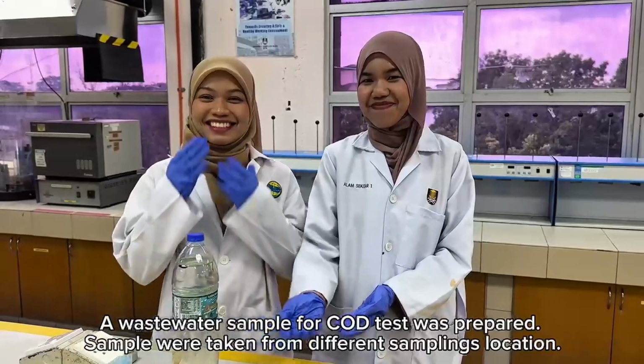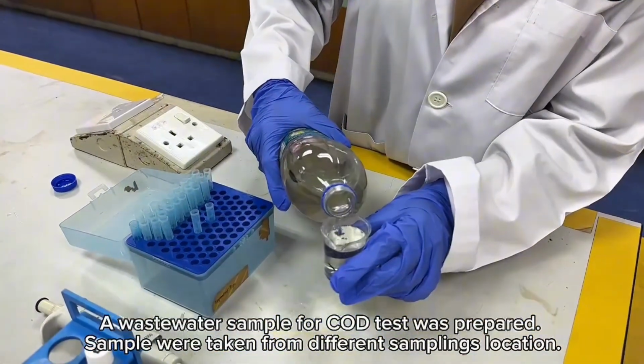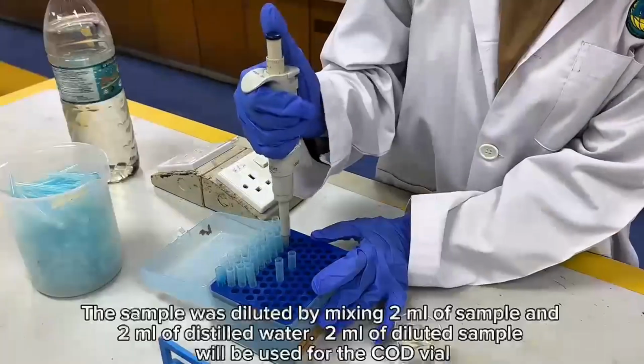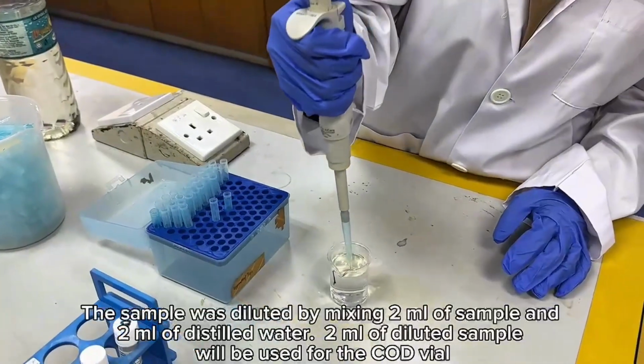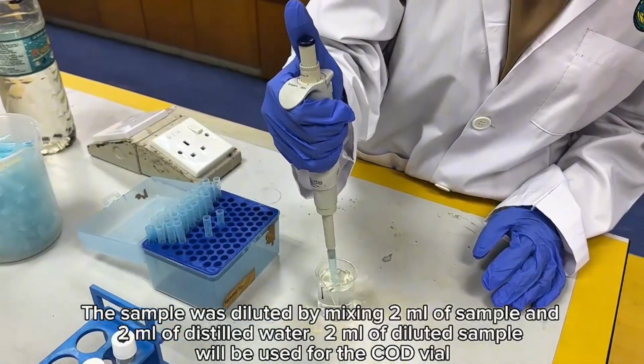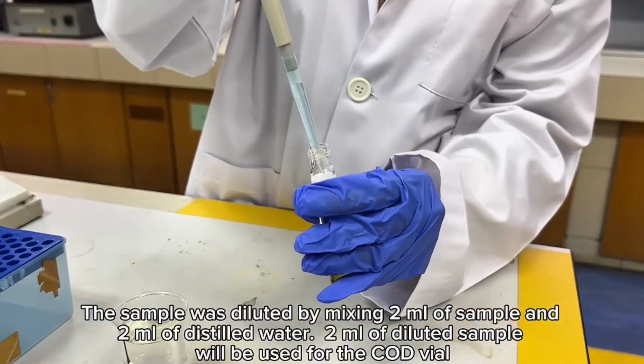We are doing the COD experiment. A wastewater sample for the COD test was prepared. Samples were taken from different sampling locations. The sample was diluted by mixing 2 milliliters of sample and 2 milliliters of distilled water. 2 milliliters of the diluted sample will be used for the COD vial.